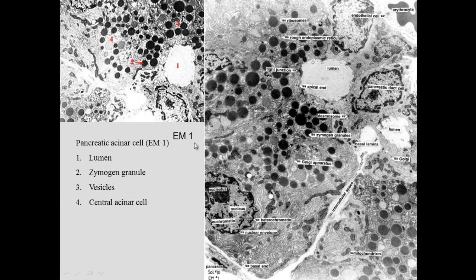And here we see the pancreatic acinar cells with lots of rough endoplasmic reticulum, a big euchromatic nucleus with a big nucleolus associated with making ribosomal RNA, and then finally the production of zymogen granules. You see some that are less condensed, and finally they're released at the surface.